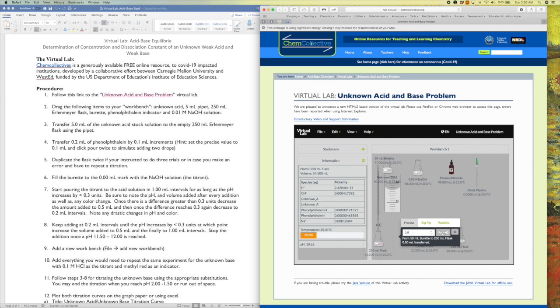And so, okay, that was good. It's going up by 0.08, that's fine. Right, it's not going up by so much anymore. So that was an increase of 0.05. So let me increase this to 1 milliliter again. But also notice you want to pay attention to your burette, right? Because your burette is about to become empty.